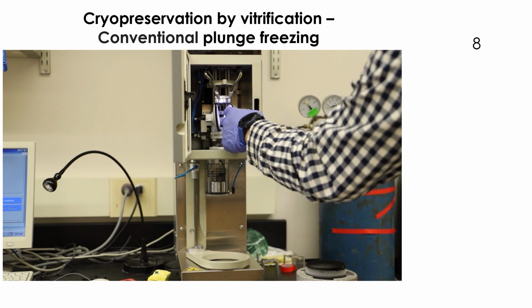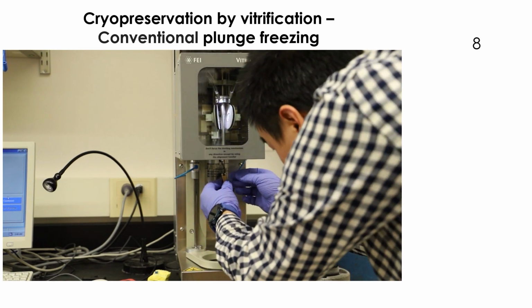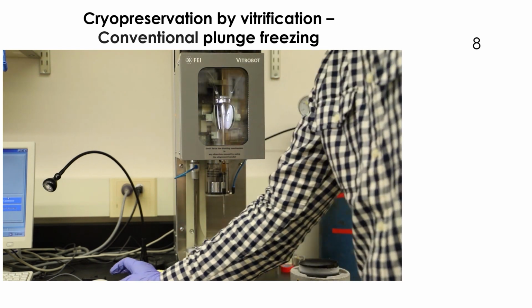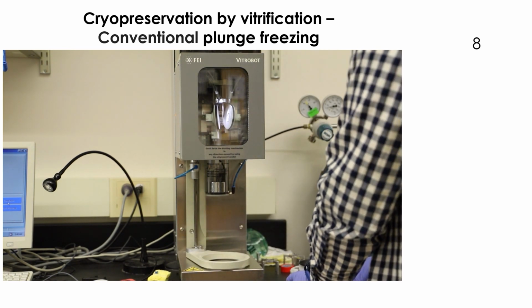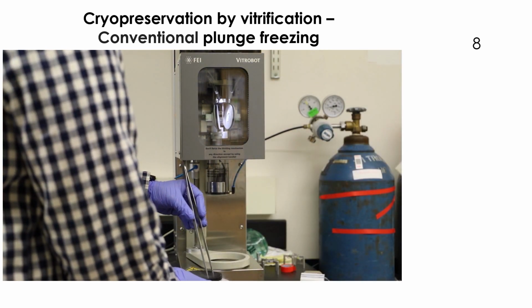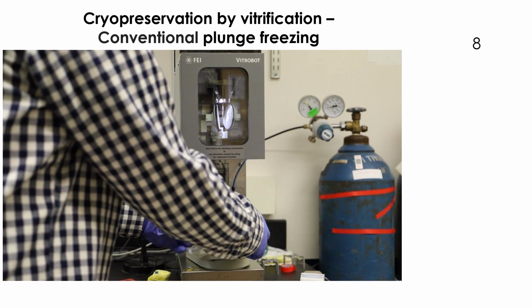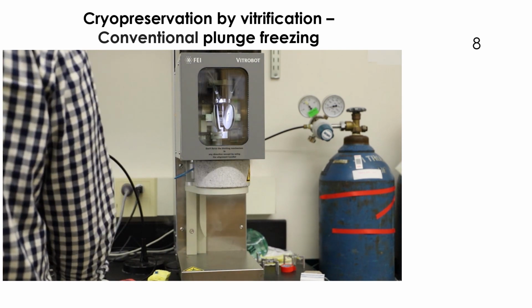Filter paper is attached to the blotting pads, and the tweezers are mounted onto the plunge freezer. The cryogen bowl is placed onto the plunge freezer, which is then raised against the sample loading chamber.